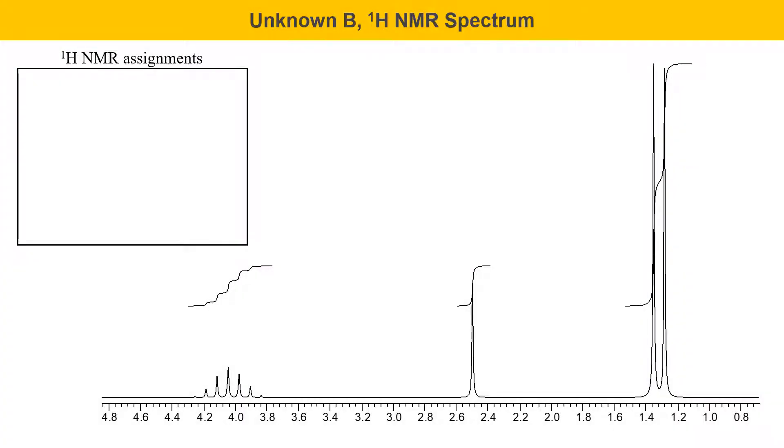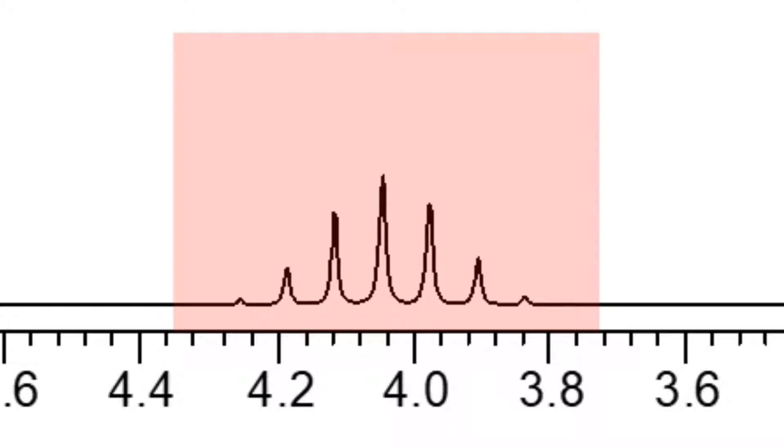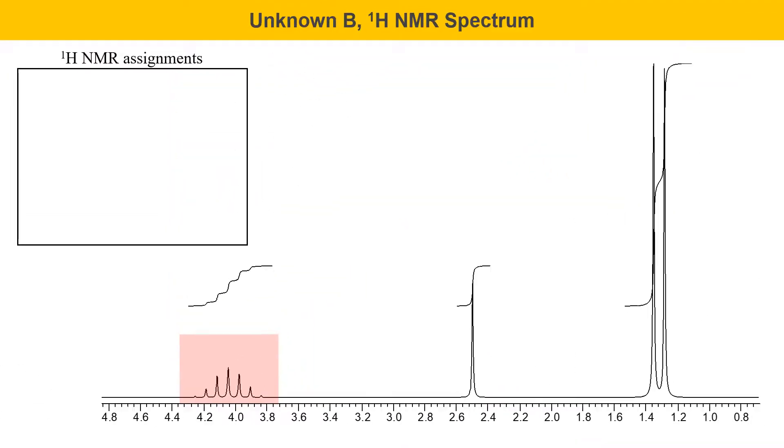Here's the proton NMR spectrum for unknown B. One of the things that's important to note about this particular spectrum is that there's a signal here, out around 4 parts per million, that's actually got 7 peaks. At first glance, it looks like there might only be 5. If you look carefully, you can see 2 small signals on either side. Those are important. There's actually 7 peaks here. This is a septet, which means it has 6 neighbors by the n plus 1 rule. That's going to be important for solving this structure. One other thing that's sometimes confusing, if you look at the big signal at 1.3, that's actually a large doublet. Some people wonder, is that 2 singlets? Is it a large doublet? It's a large doublet.